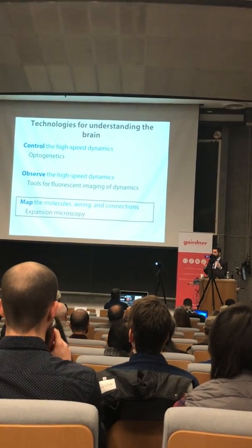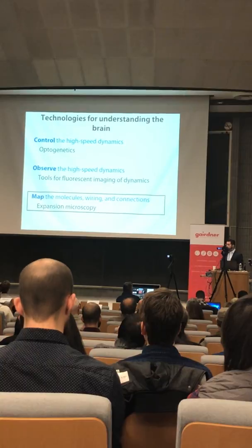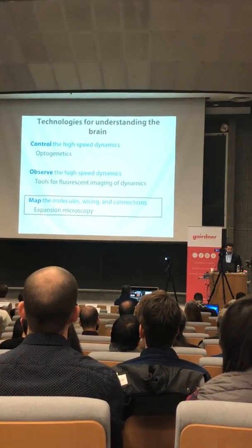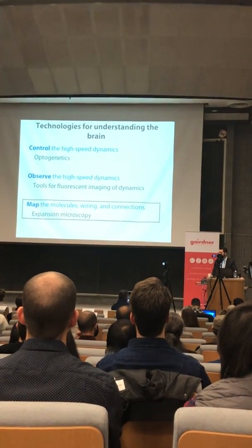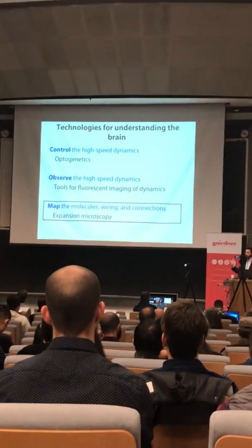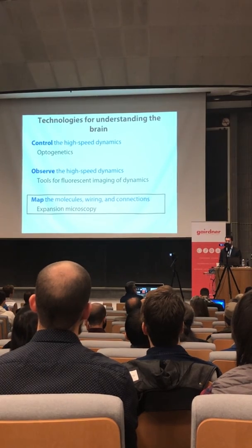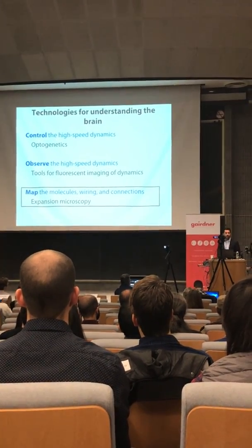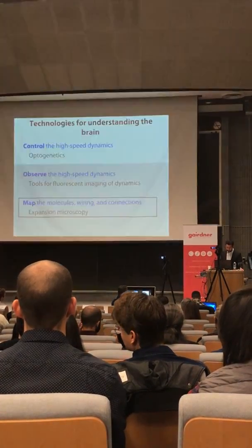We wanted a way that we could look at entire neural circuits, but get down to the resolution of individual synapses or axons or neural connections or even biomolecules. And so super resolution microscopy, of course, is very famous. Some of the inventors won the Nobel Prize a couple years ago for their efforts, for example. But it's difficult to apply to a large-scale 3D structure, like a brain circuit. It can be too slow, or it can struggle to image very deeply into it. And then electron microscopy gives you incredible resolution, but really struggles to get molecular information.